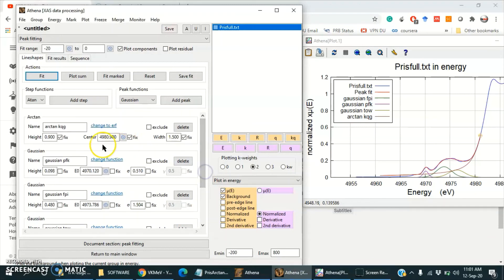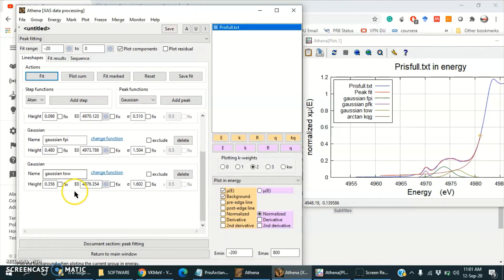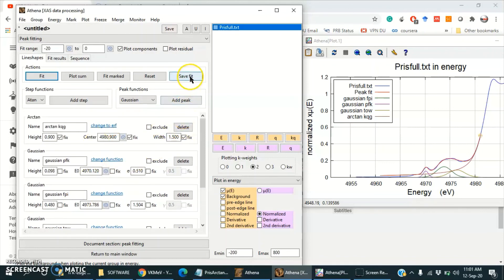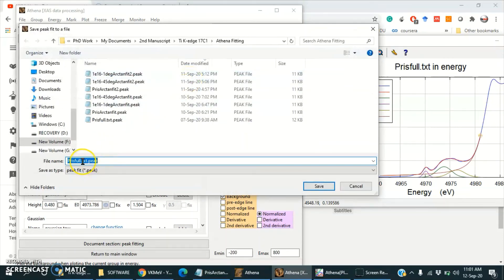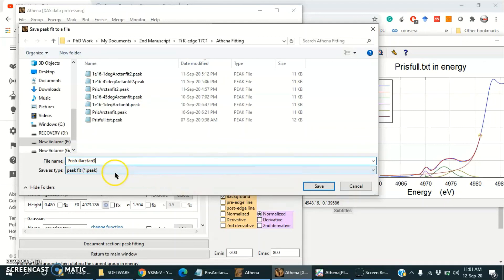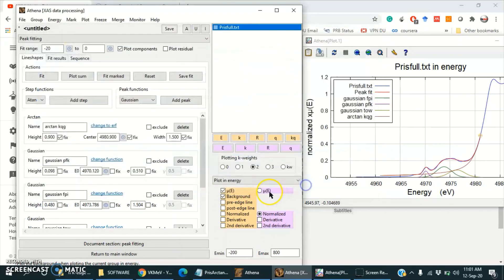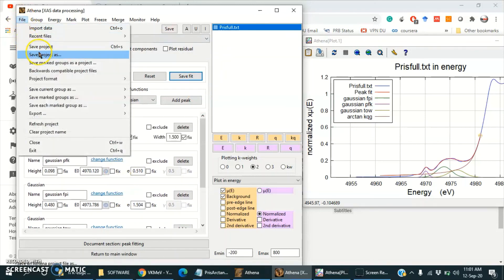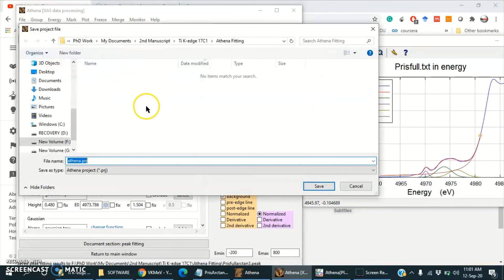We have fitted the spectra using an arc tangent function and 3 Gaussian peaks. We can save these parameters by clicking on Save Fit — the name we can write is arc tangent function 3, and the extension of this file will be .peak, which we can open using Notepad. If in future we want to change these parameters, we can save the project by clicking on Save Project As and entering the file name.